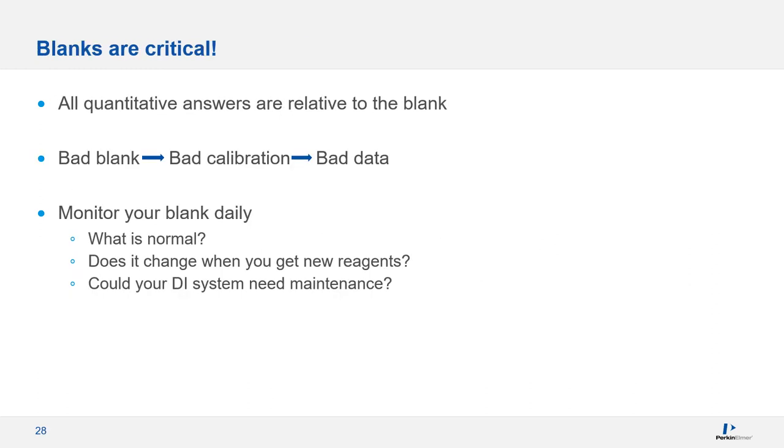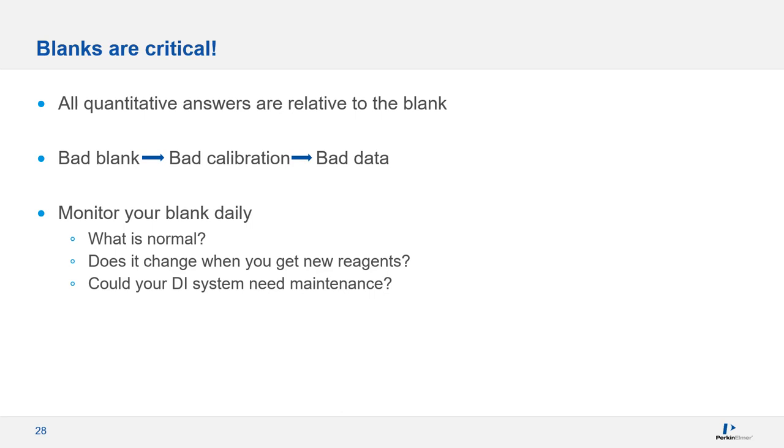So right about now you're thinking, did she just say I had to wash for 10 minutes before analyzing my blank? Remember that all of your quantitative answers are relative to the blank. It's an absolutely critical part of your calibration. You need to know what your normal blank levels are. For this, you have to look at the raw counts, not the concentrations. If you see a change, can you think of a reason why that might have happened? Maybe you switched lots of acid or you've recently had maintenance done on your deionized water system. Keep in mind that even though your calibration might look linear, it could still be bad if the blank reads high due to carryover or contamination.